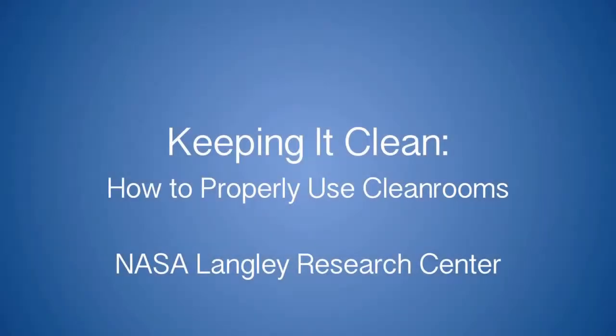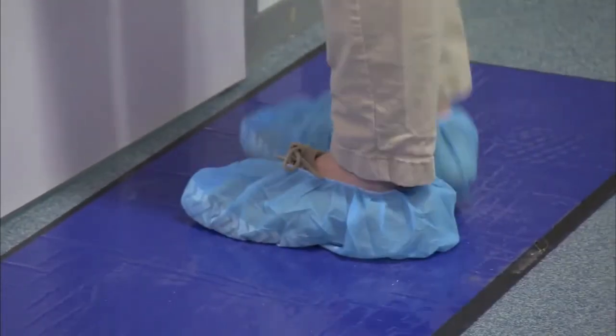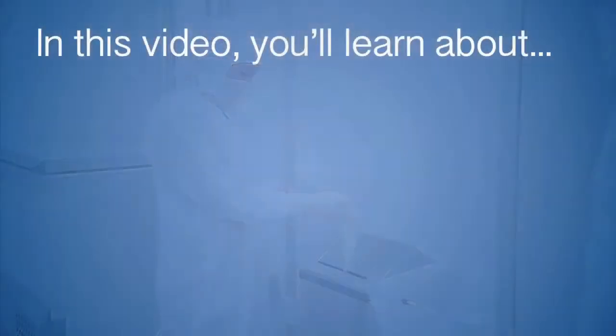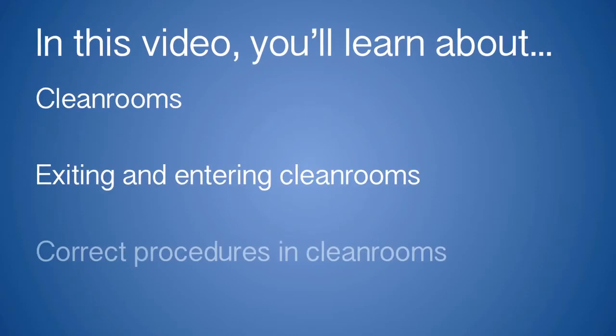Welcome to Keeping It Clean, How to Properly Use Cleanrooms, provided by NASA Langley Research Center. Cleanrooms are one of the most valuable tools in limiting contamination of sensitive hardware, such as optics, science instruments, and spacecraft. In this video, you'll learn about cleanrooms, how to enter and exit a cleanroom properly, and correct procedures for operating in a cleanroom to ensure minimal contamination.